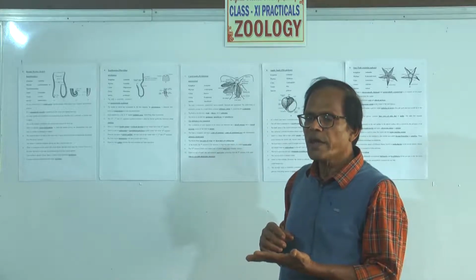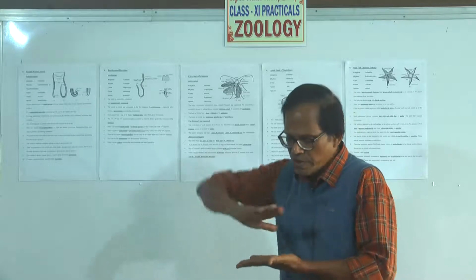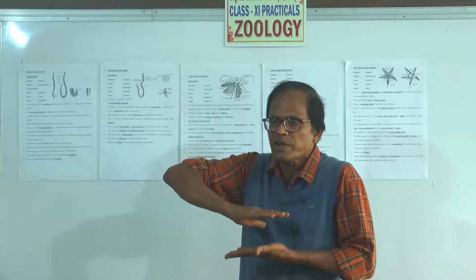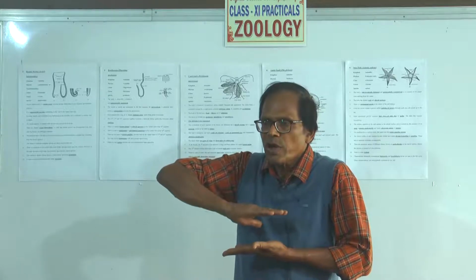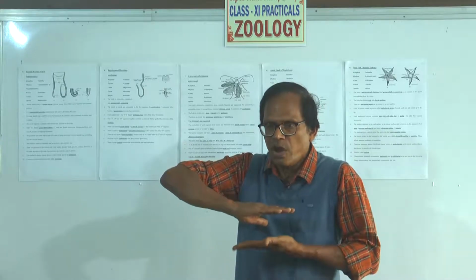it will have a dorsal cuticular cover called tergum, a ventral cuticle. This is the dorsal side. The right palm is the dorsal side, the left palm is the ventral side. Look at this. The dorsal cuticular cover of each segment constitutes a tergum. The ventral constitutes a sternum.